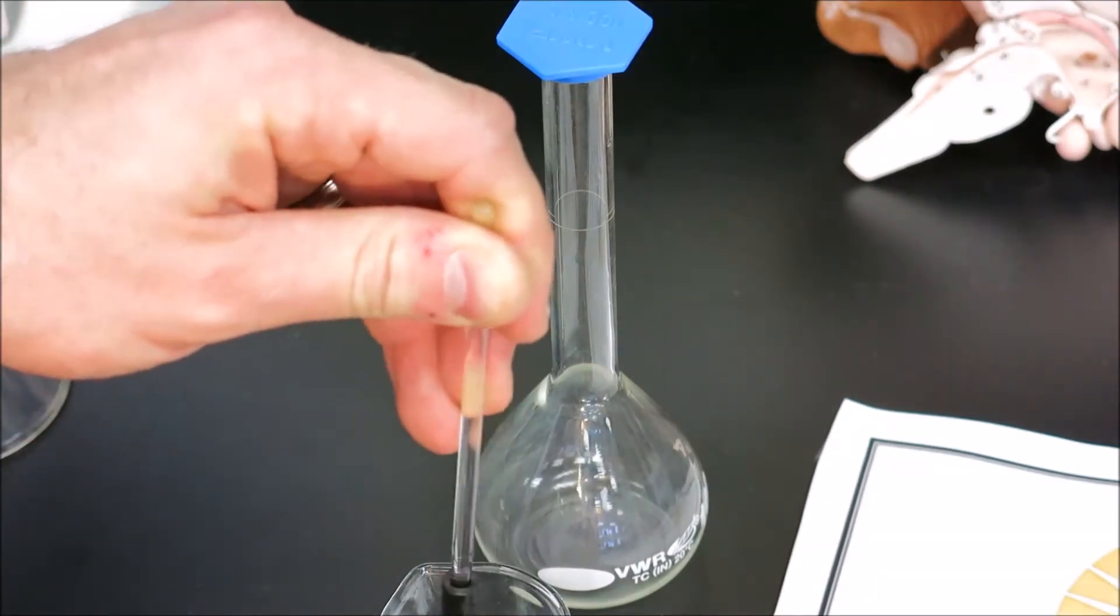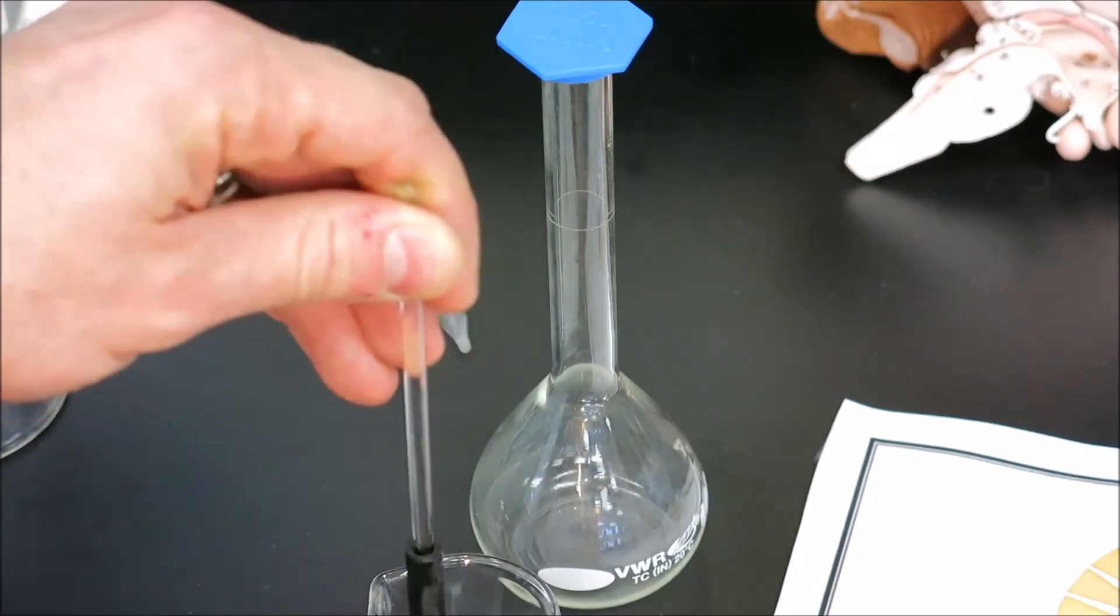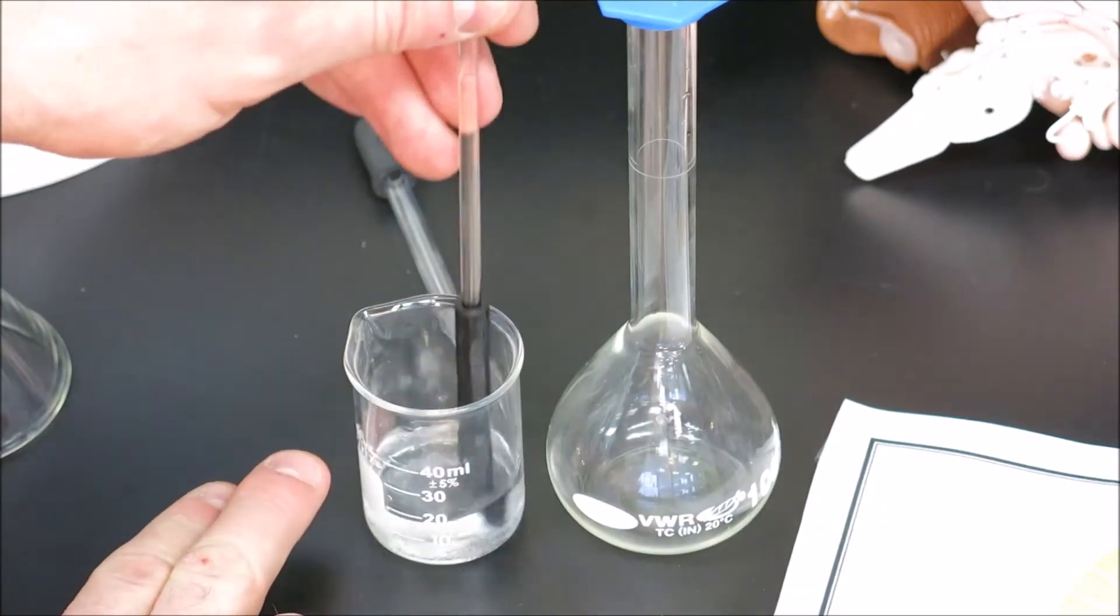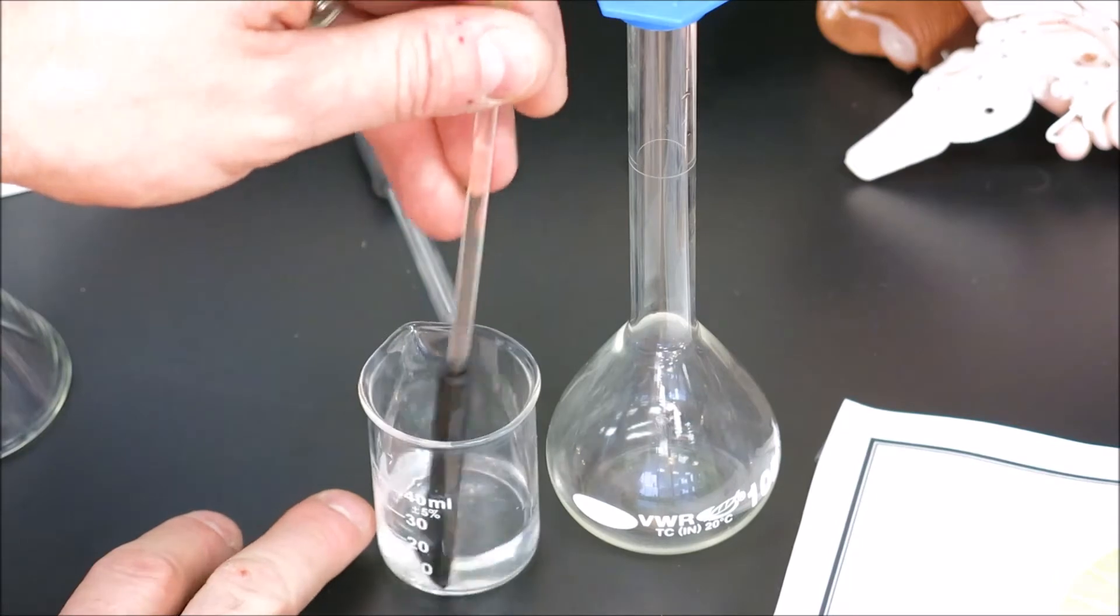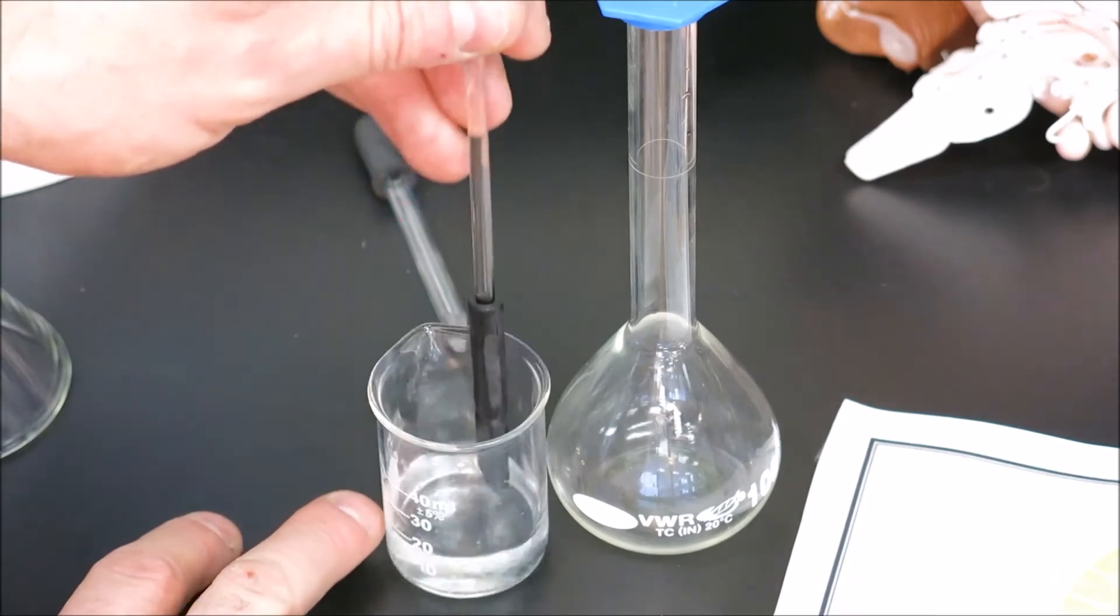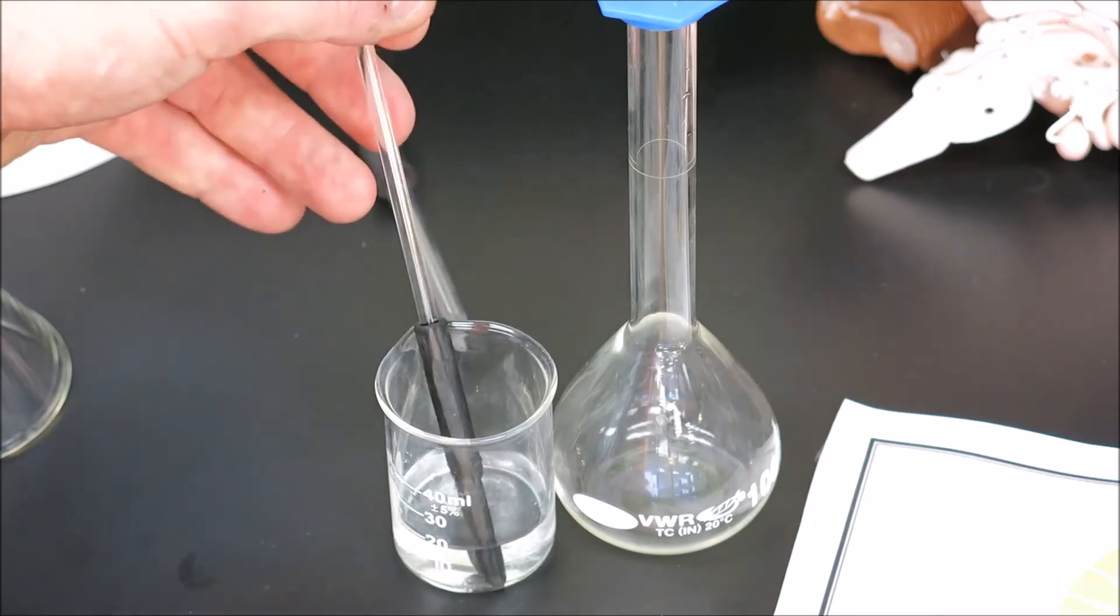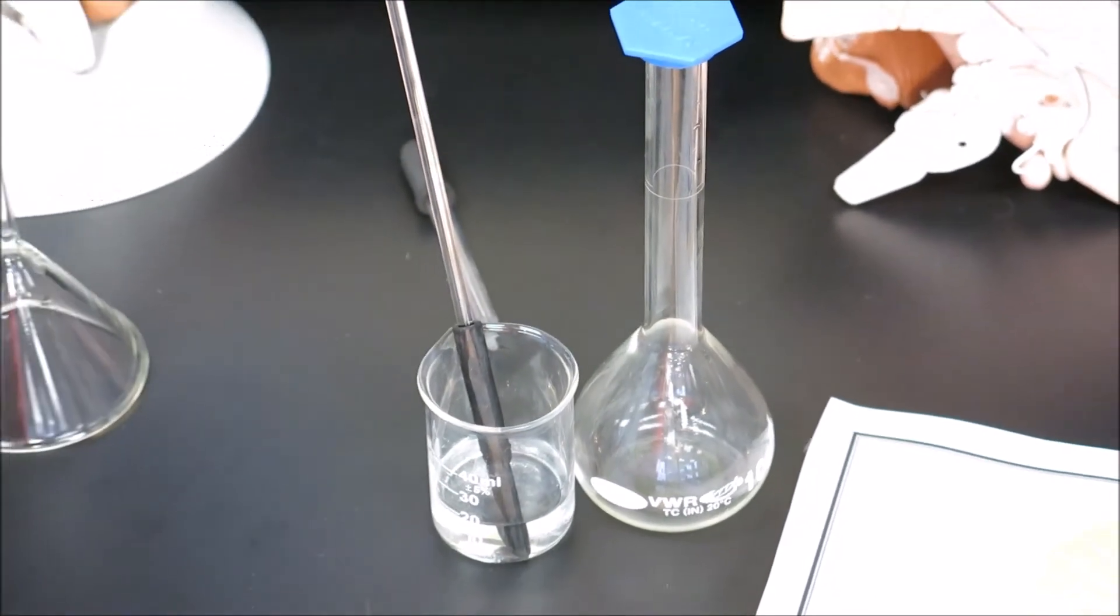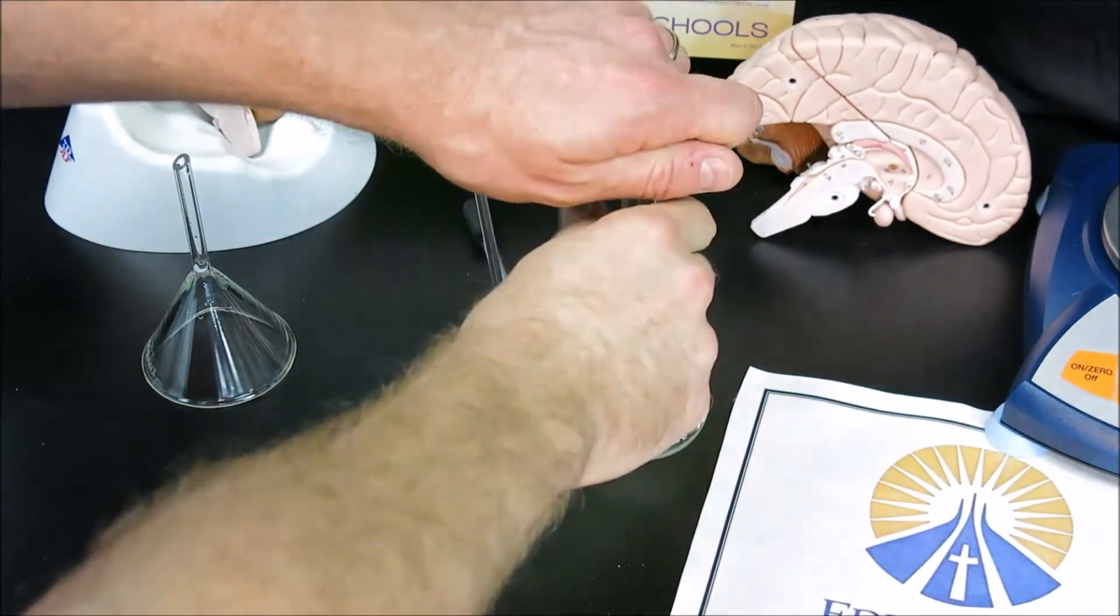So 20 mils is a good start, and we'll stir to try and dissolve the solid. The solid might not completely dissolve, and we'll do several rinses as it gets poured into the volumetric flask. Once we're ready to pour, we'll take the lid off the volumetric flask and place a funnel into the flask to help pour past the neck.